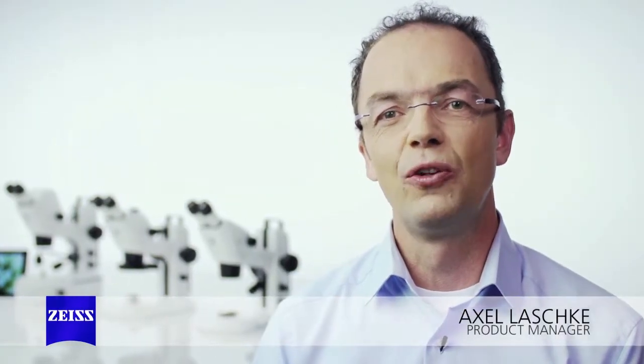My name is Axel Laschke. At Zeiss, I'm the product manager for STEMI 305.